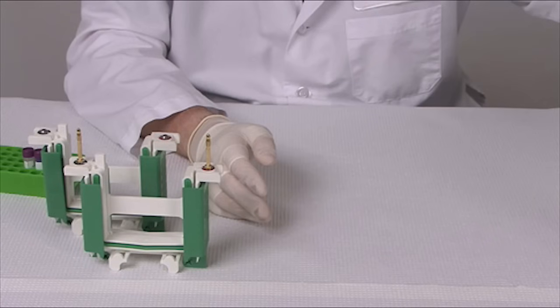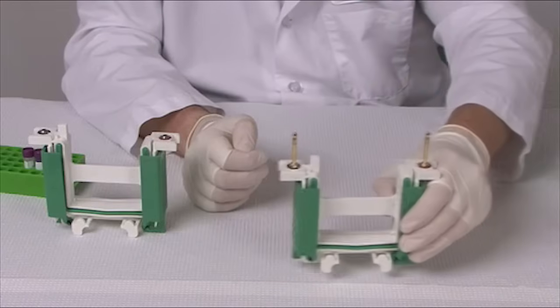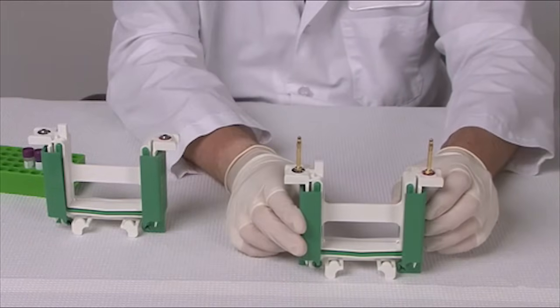To begin assembling the TGX gels in the MiniProtein TetraCell, prepare the electrode assembly module by opening up the wing clamps on either side.